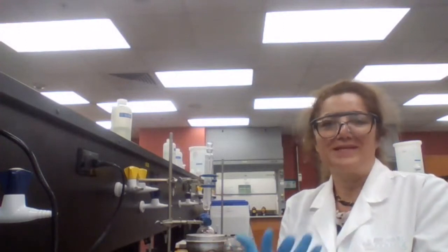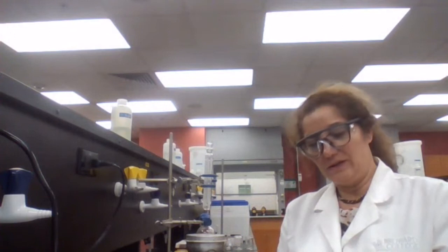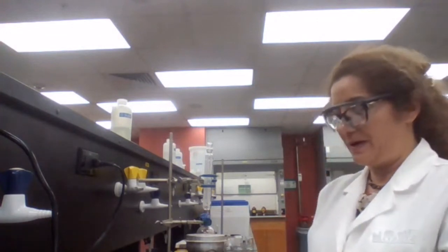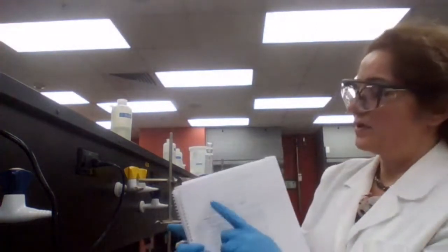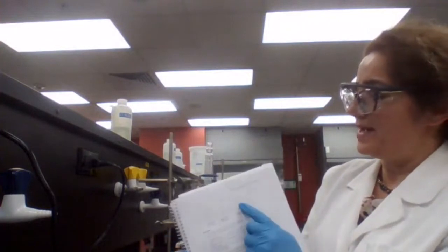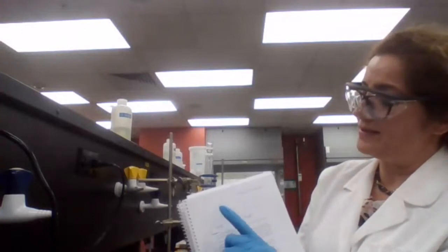When we are learning IR, that would be like experiment 17, where we will have some introductory IR. We learn those numbers. But when we are using the application of the IR in the experiment, we look at our experiment and say, okay, what is the point of difference here? I have carboxylic acid. I have ester. Carboxylic acid, if it's open chain and not conjugated, is going to have a peak at 1715.